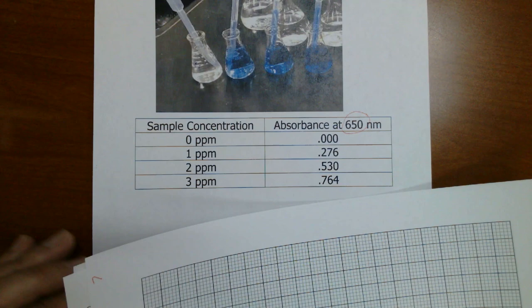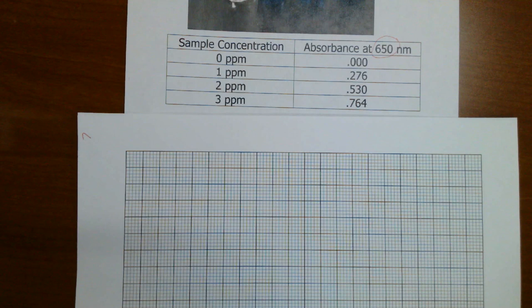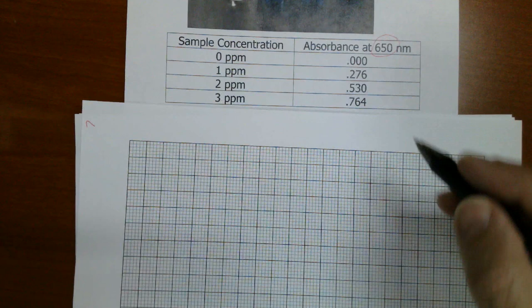Let me see if I can get the numbers in there as well. I might not be able to fit all the numbers in. But what I like to do when I'm using graph paper is use as much of the paper as possible. So I counted the number of squares on the x-axis here, and I found that I've got 22 squares going from left to right. And counting in this direction, I have 17 squares.